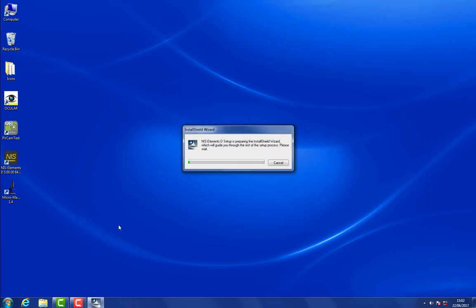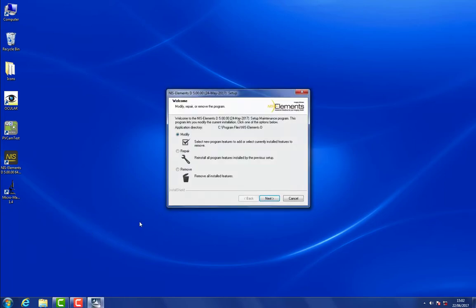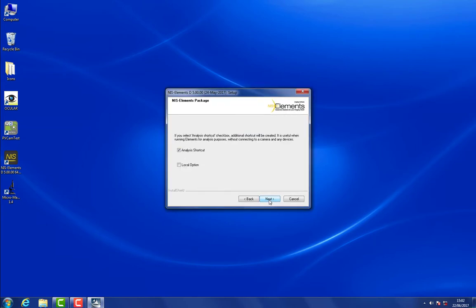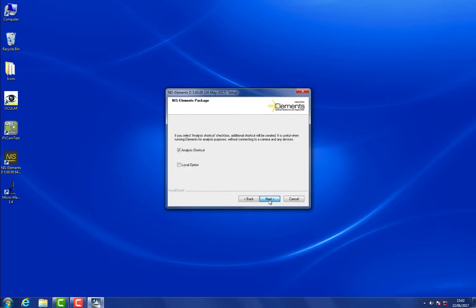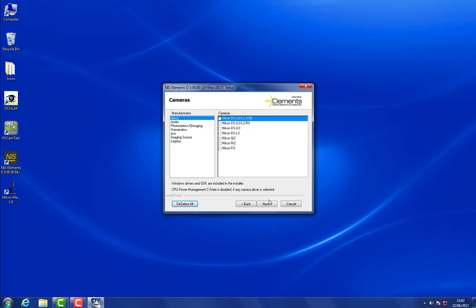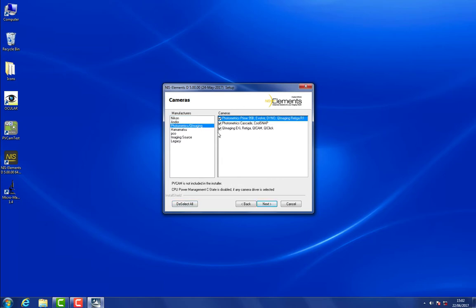Unless you haven't already installed Elements, in which case you can do this when you first install. So we want to modify this installation, and now we click Next until we reach our list of cameras. Here you'll want to go to Photometrics, Queue Imaging, and select all the groups of cameras that you have, or that you expect to use.